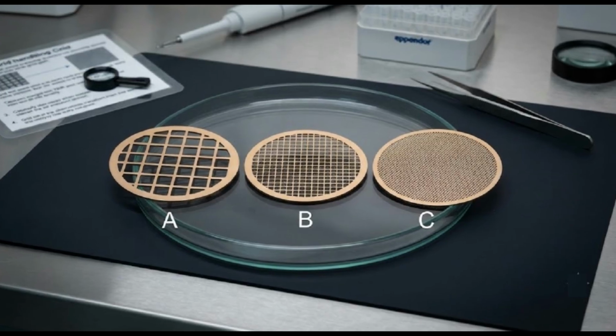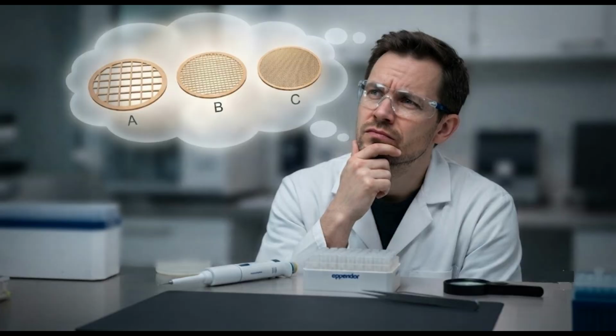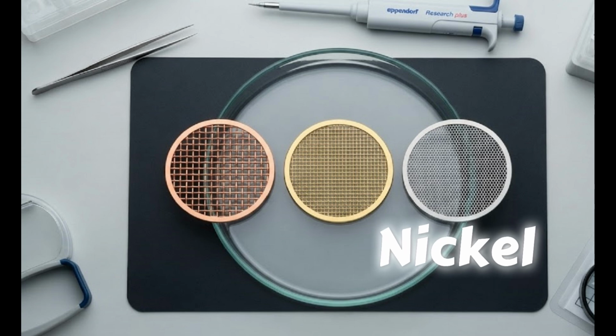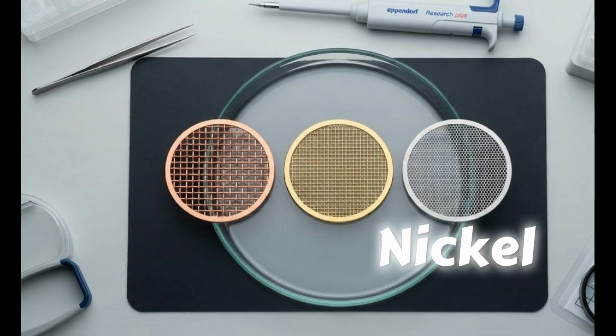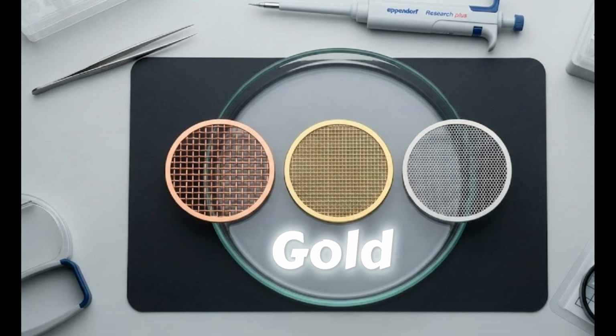There is a wide variety of grids available, each tailored for specific purposes. Let's break them down by material and application. Copper grids. These are the most common and cost-effective choice, ideal for general-purpose imaging. Nickel grids. These are essential when working with reagents or solutions that react with copper. They are also the preferred choice for most immunolabeling procedures. Gold grids. Gold is chemically inert and highly resistant to corrosion and oxidation. These are used in high-sensitivity analyses where even minor metallic contamination or reactions could compromise your results.